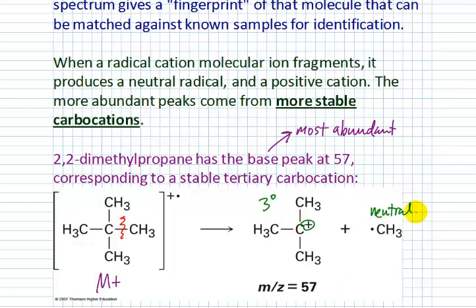That mass selector requires the particles be charged so that they are able to be influenced by that magnetic field. This neutral radical is not observed in the mass spectrum. Okay? Neutral molecules will just continue flying straight, whereas the cations, like this one, their trajectory will be deflected by those magnets.